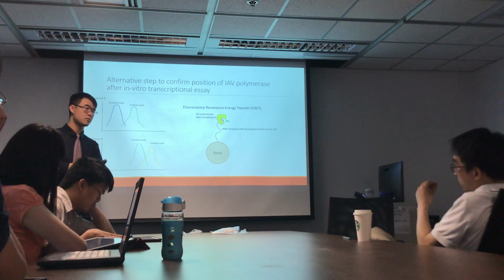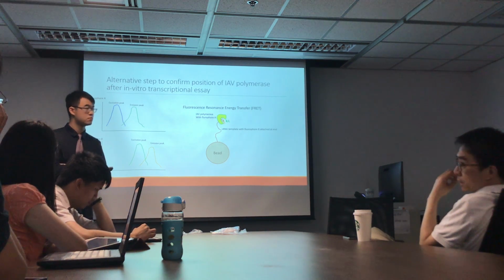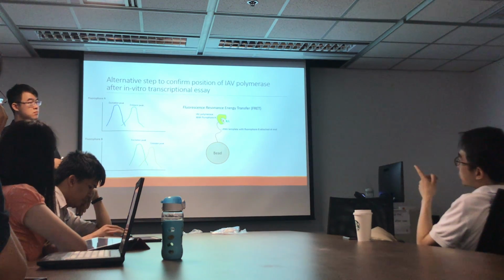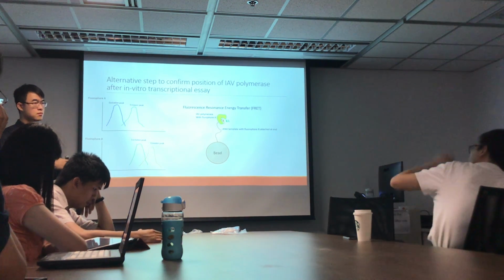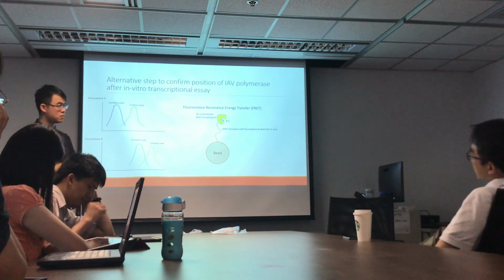But that will be much faster than flow cytometry. Yeah, so this will be at a millisecond time scale. It's a totally different device. For flow cytometry, I don't think you can give such a high pressure. You need a very high pressure to push the system to flow that fast to look at the millisecond dynamics.